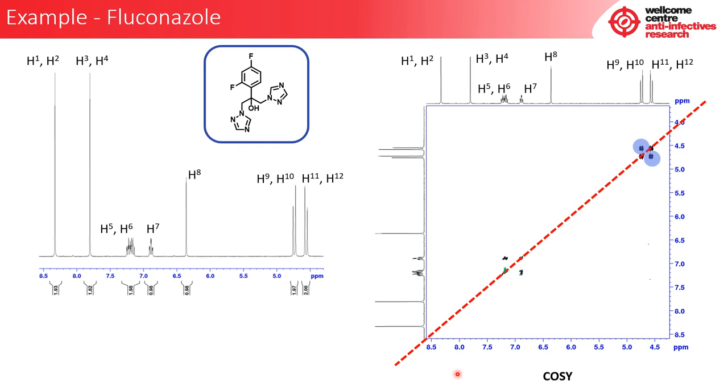So taking the first example here, we can now see that protons 5 and/or 6 can see number 7. So this is now telling us that these two sets of peaks can see one another. Which proton, because remember there's two underneath here, can see number 7, again, we still don't know this. What else do we know about the spectra?